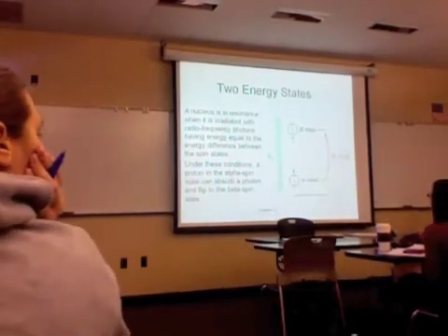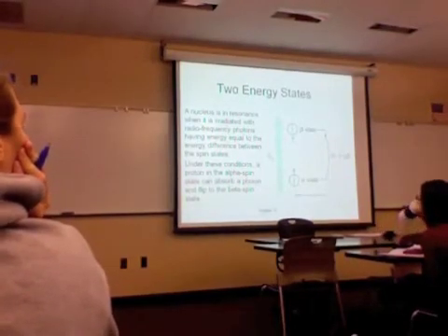So far, so good. We get our nuclei aligned with or against, and then we apply just the right electromagnetic radiation to give them the resonance.